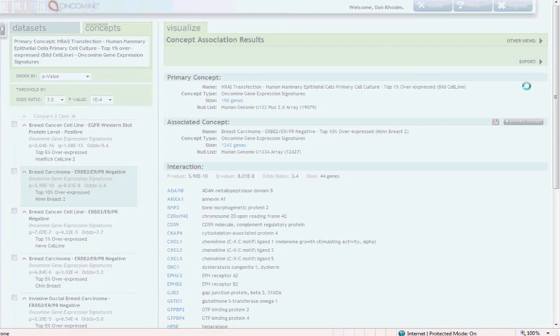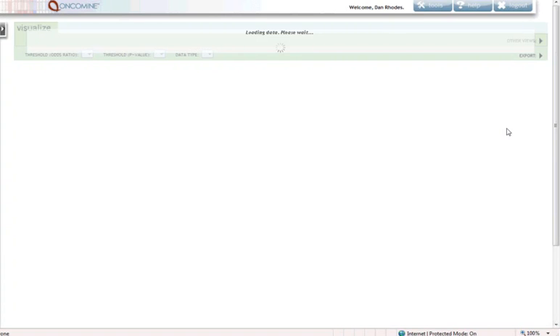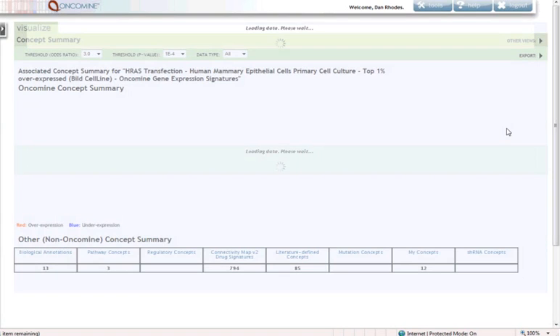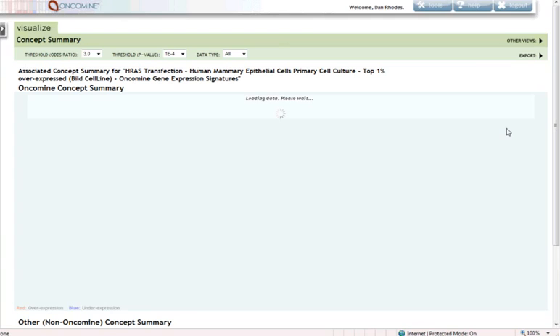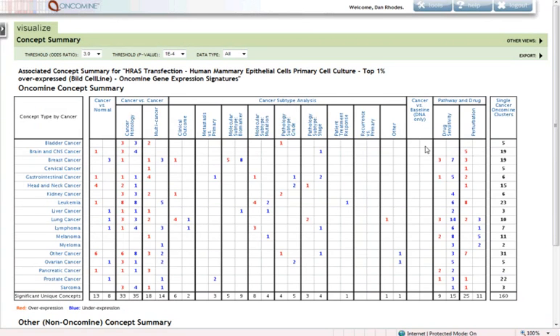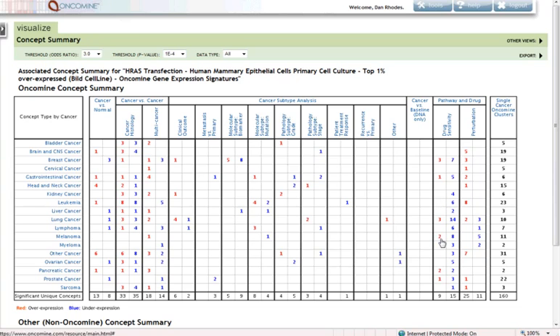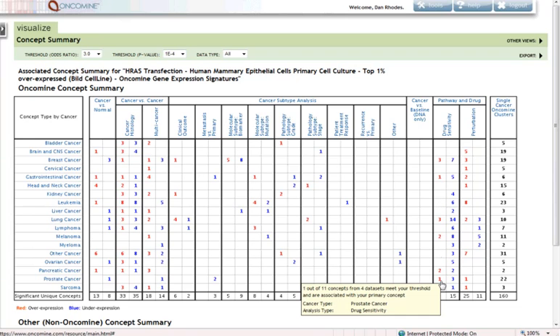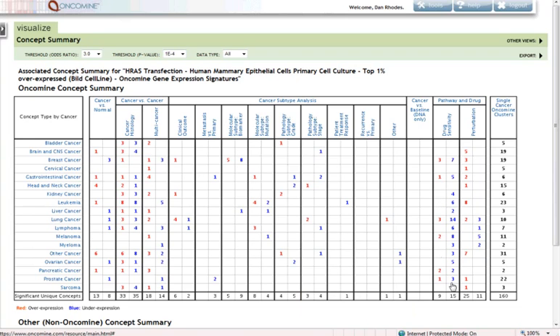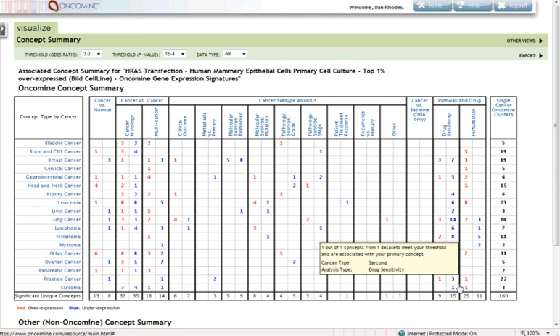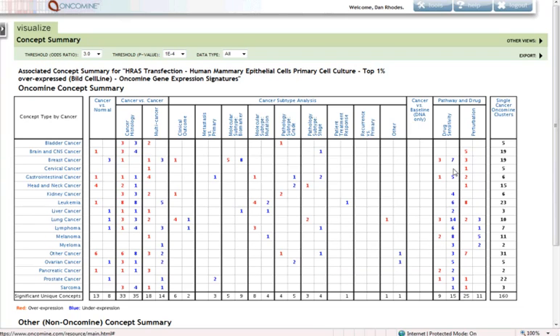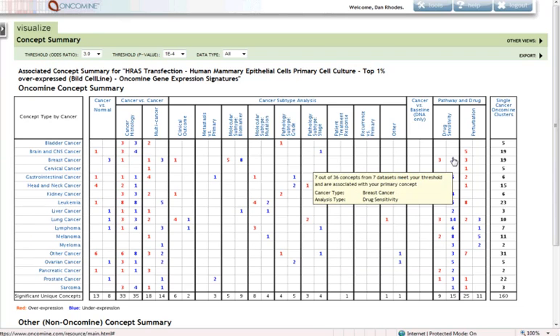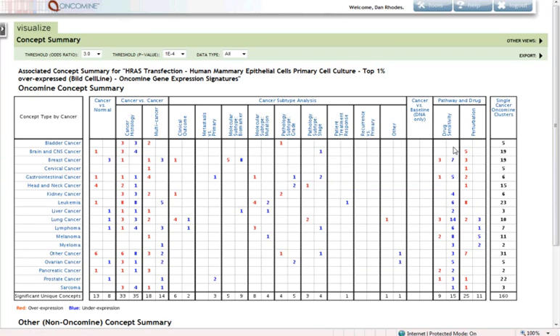Let me jump back to the summary. We'll make a couple more observations, and then we'll wrap up. Looking down here at the pathway in drug associations, we see that the RAS pathway is linked to drug sensitivity signatures, as evidenced by the red numbers here, as well as the RAS pathway is underexpressed in drug sensitivity analyses. Restated is linked to resistance to drug.